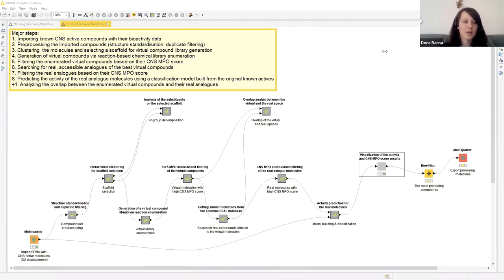And so here we have the compounds, their calculated CNS MPO values, and the red dots are for non-actives, the green ones are for the actives, and the tile views will show us those chemical structures which we select in this interactive view. So first, to make this selection, I will switch off the non-active ones, because I'm only interested in the actively predicted ones, the green dots, and then I will select. So in this set, we found 5 active compounds.